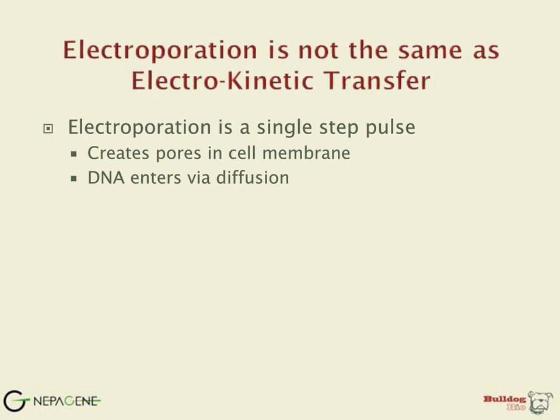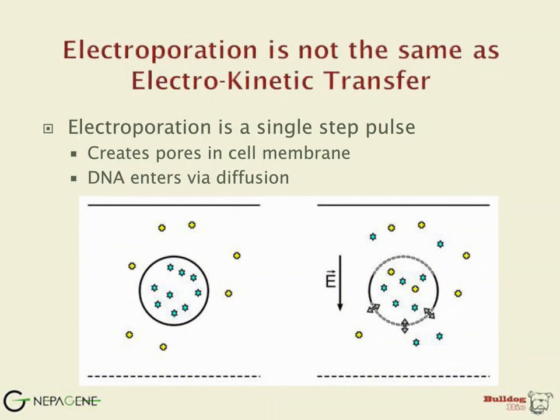Electroporation is a simple process whereby living cells are placed between two opposing electrodes and are subjected to an electrical field of short duration and high voltage, referred to as a pulse. The electrical field disrupts the plasma membrane of the cells, temporarily creating holes or pores. This allows molecules present in the cell media to diffuse into the cells before the membrane reseals.